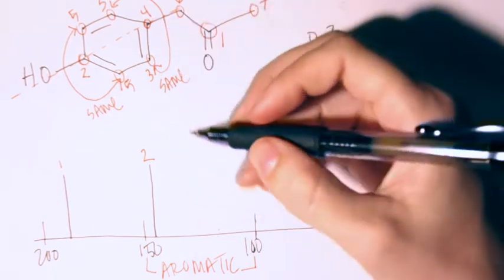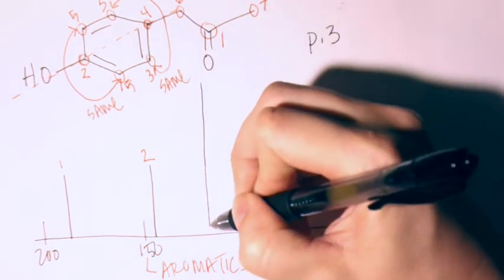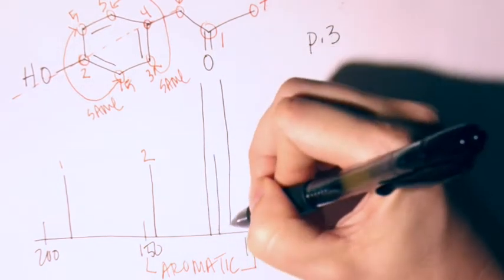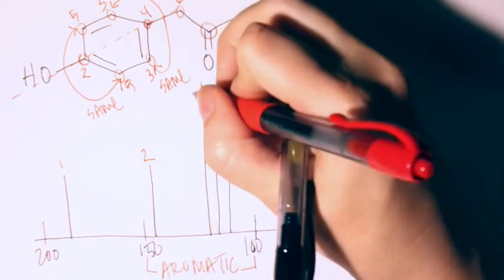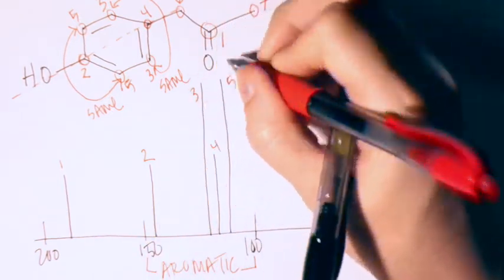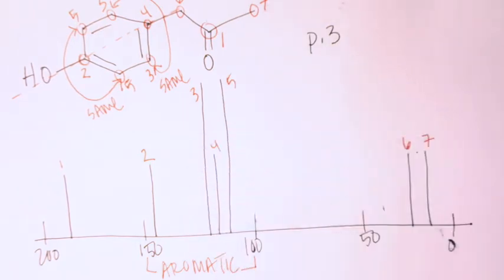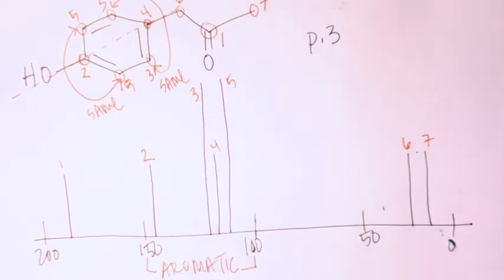You have the actual spectrum in your handout, but what you would predict is to see 2 tall ones and 1 short one, and they're all gonna roughly be in this region, right? You wouldn't be expected to predict them to be in this order, but that's where you would expect to see them. The order they're in doesn't matter either. You're just expecting to see 2 tall ones, 1 short one. Okay, so that's for that one.